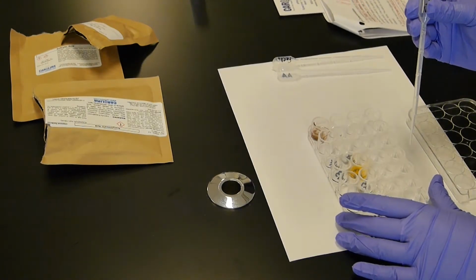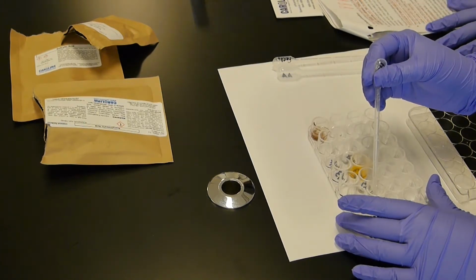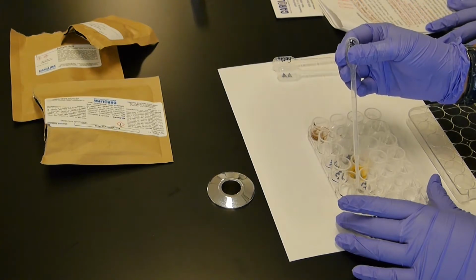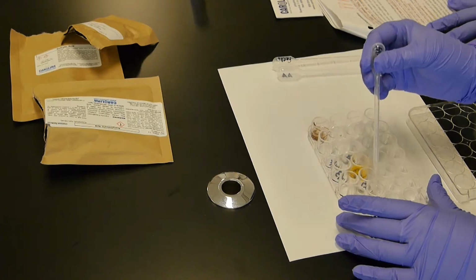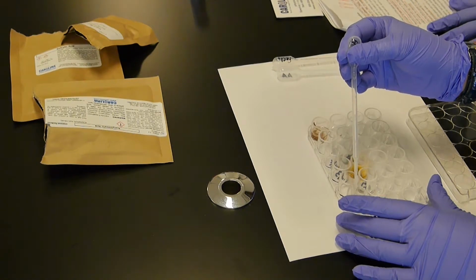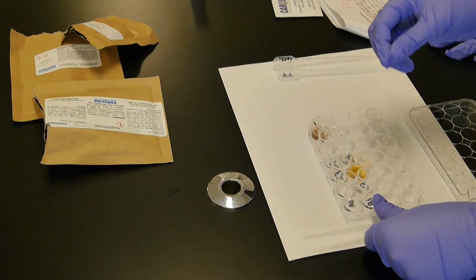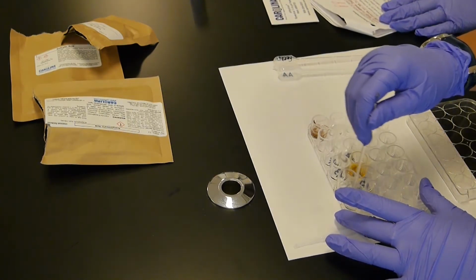We are on page 7, working on number 2. You're transferring 10 drops of ethyl alcohol, or ethanol, from B1 to A1. 10 drops, right? Right. Make sure you're using a white colored base or use paper so you can see the color change. Next would be stirring this. Our stirring rod is so skinny. There it is in my cup. Very skinny.